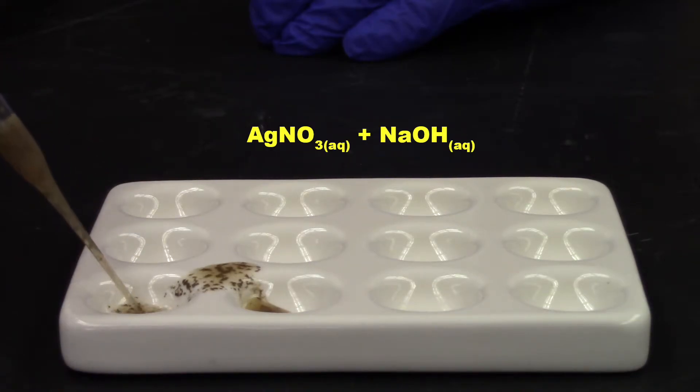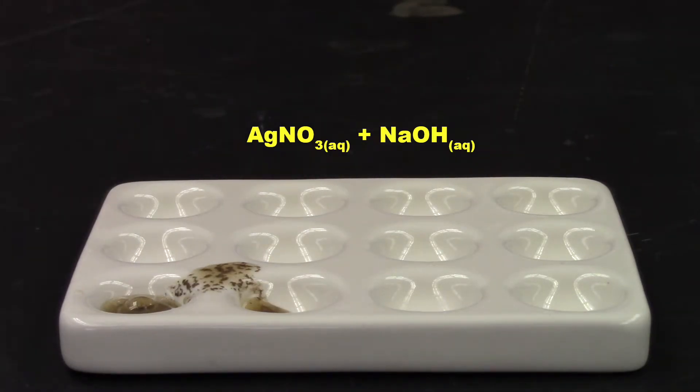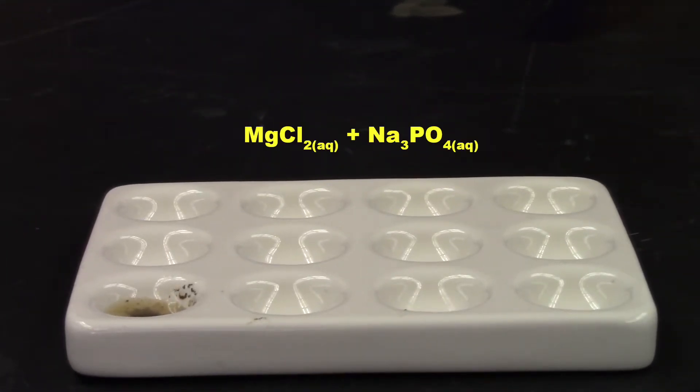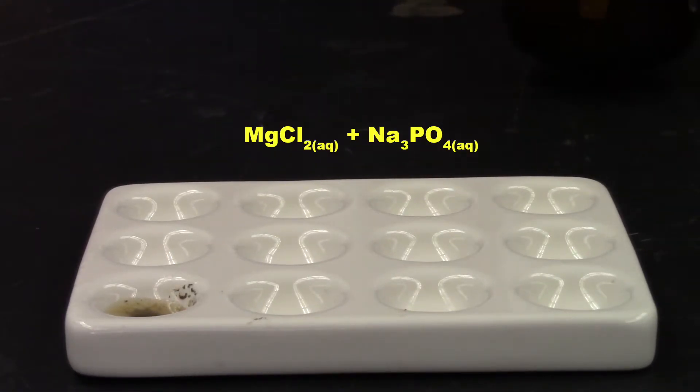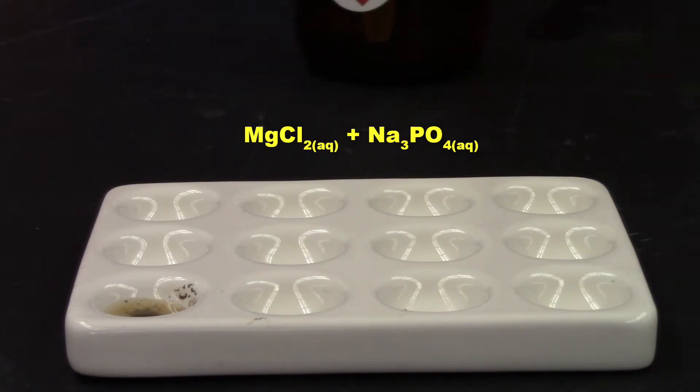So two clear, colorless reagents gave us a murky brown, solid, liquidy substance. Next up on the list. Magnesium chloride with sodium phosphate.